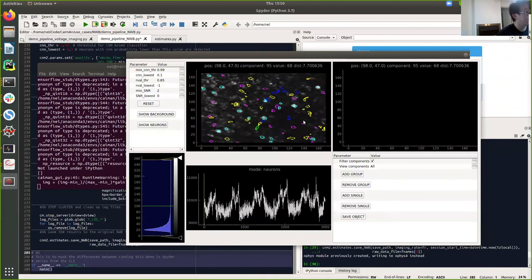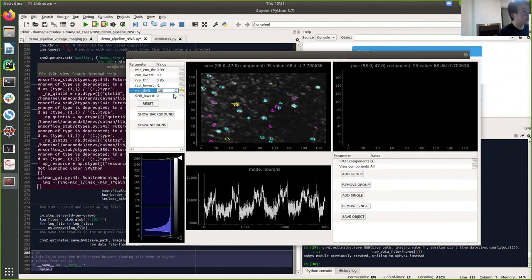And finally, we want to see the reconstructed video. So the left is the raw movie. The middle is the reconstructed one. And the right is the residual movie. So we should see a clearer spatial footprint in the middle. And we should see almost no components in the residual movie. Here we can save our results into NWB format. It's really easy.